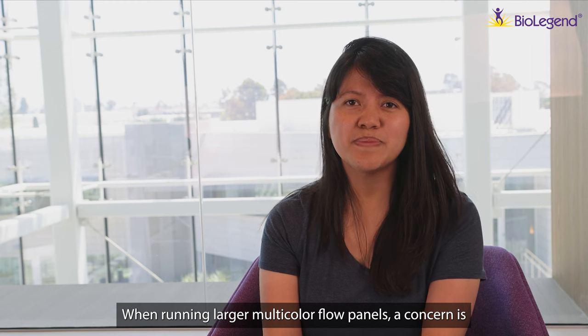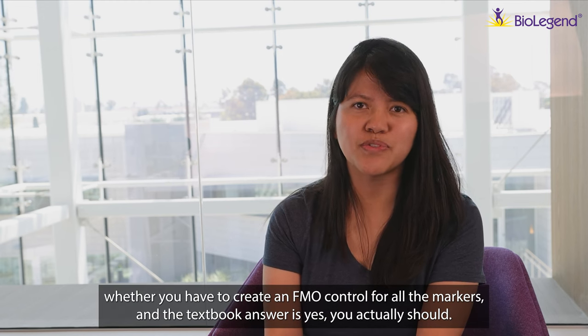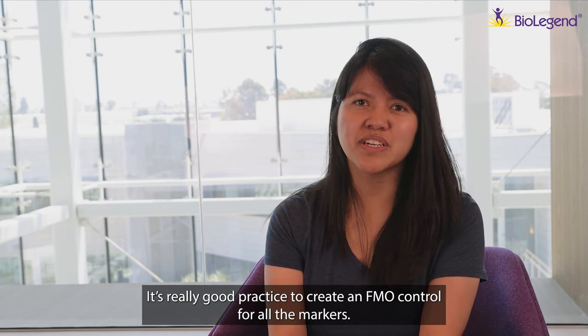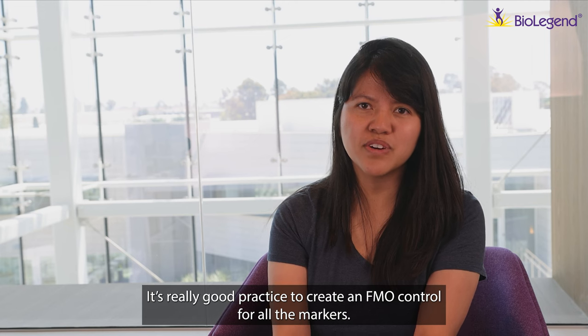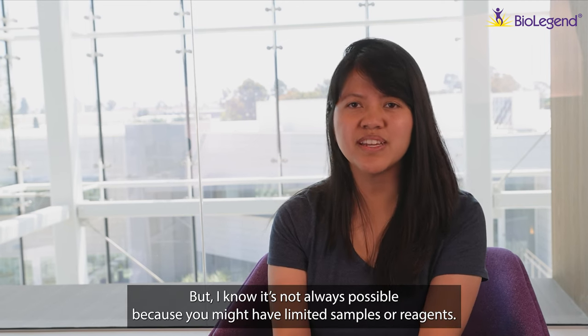So when running larger multicolor flow panels, a concern is whether you have to create an FMO control for all the markers. And the textbook answer is yes, you actually should. It's really good practice to create an FMO control for all the markers. I know it's not always possible because you might have limited samples or reagents.